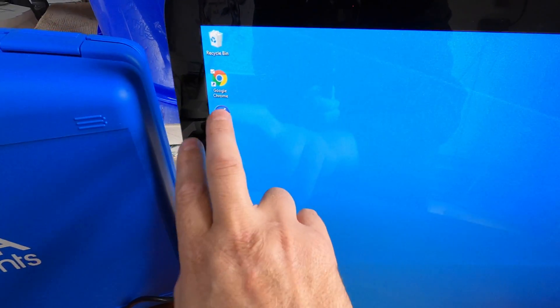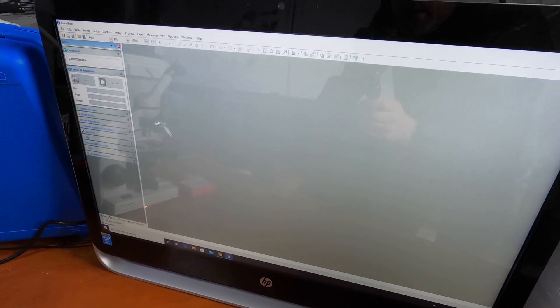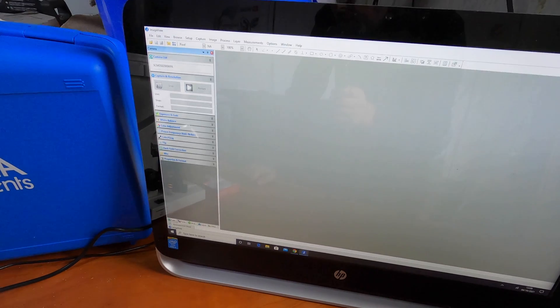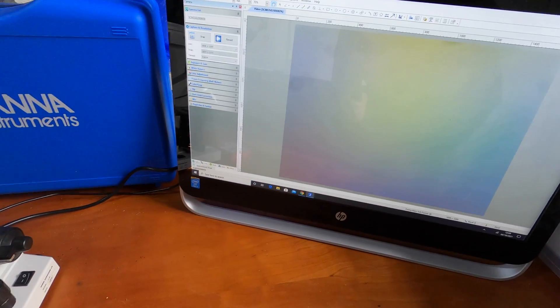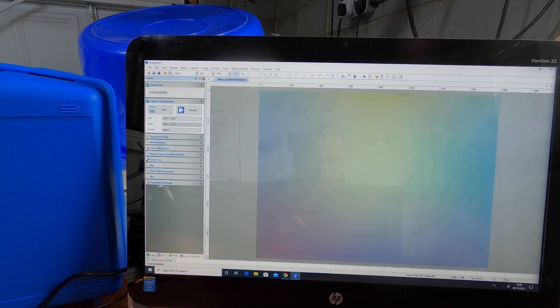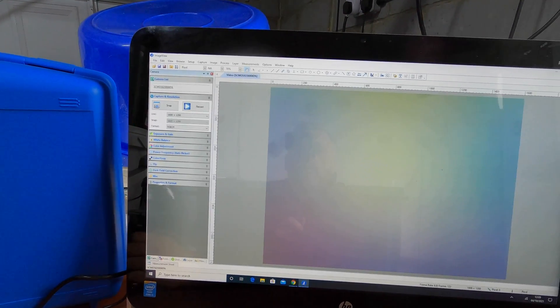We'll start the Image View app — bear with it, this PC is a bit slow but it is an old one. So that's the interface you get with the app — it's really bog-standard, really basic, but it does the job. You click on the camera that you want and it will pop up in a second.